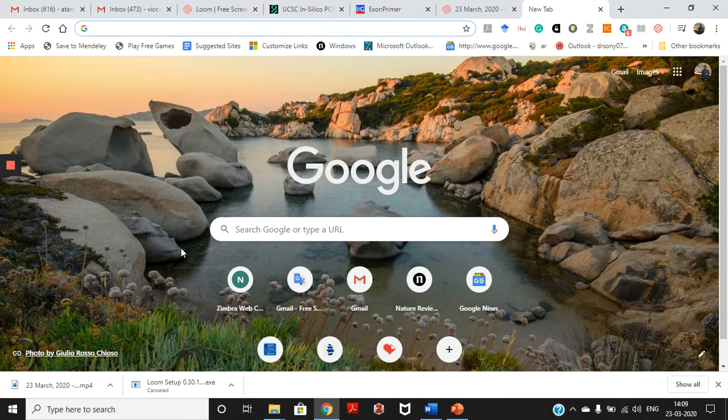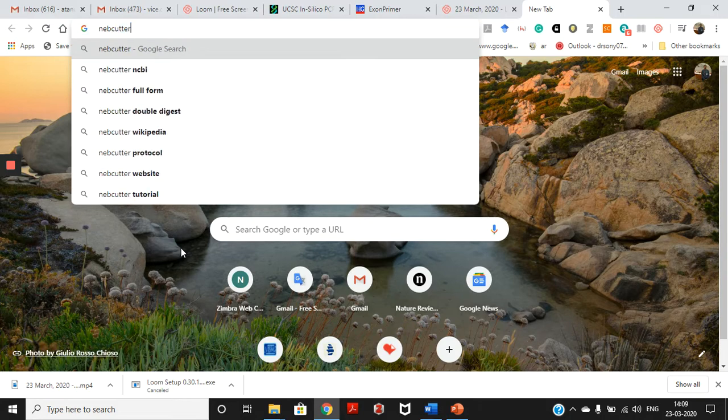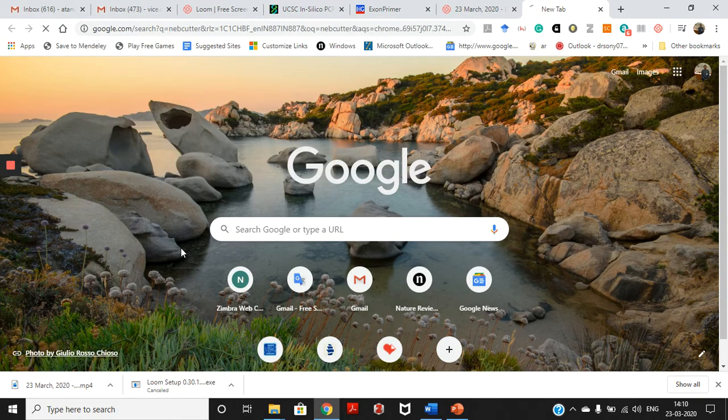We go to a particular website called NEB Cutter. We go to the NEB Cutter website.